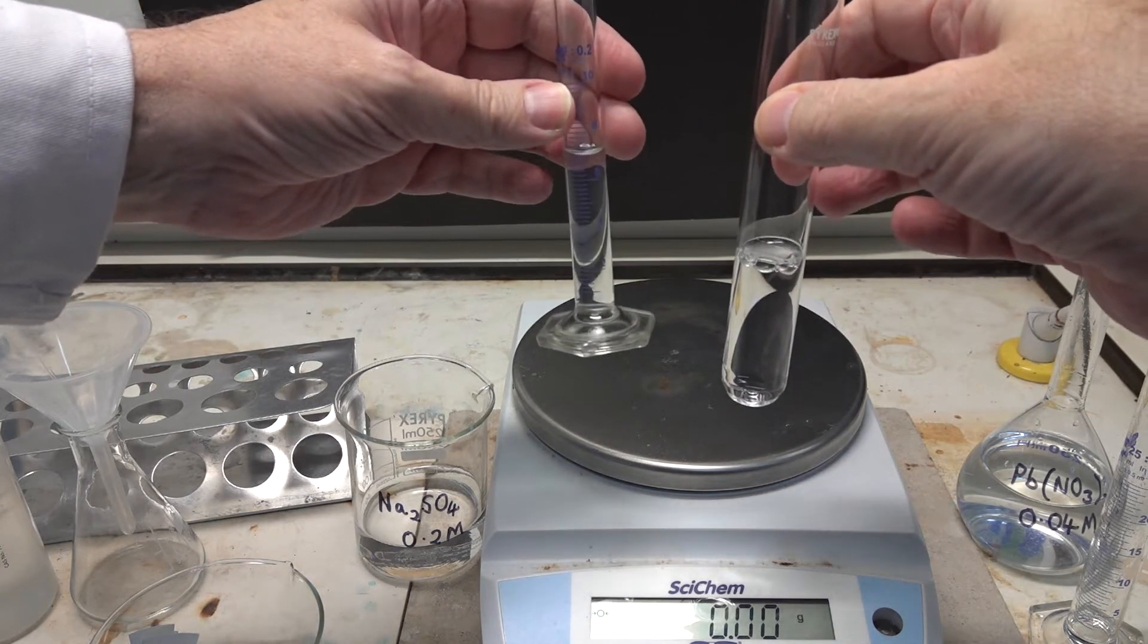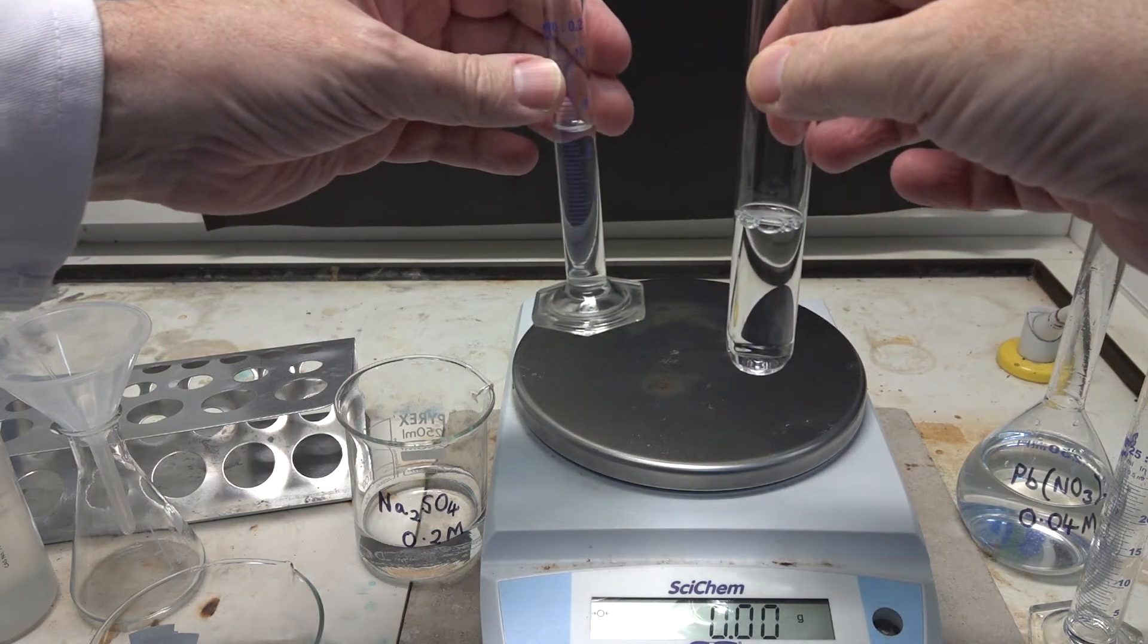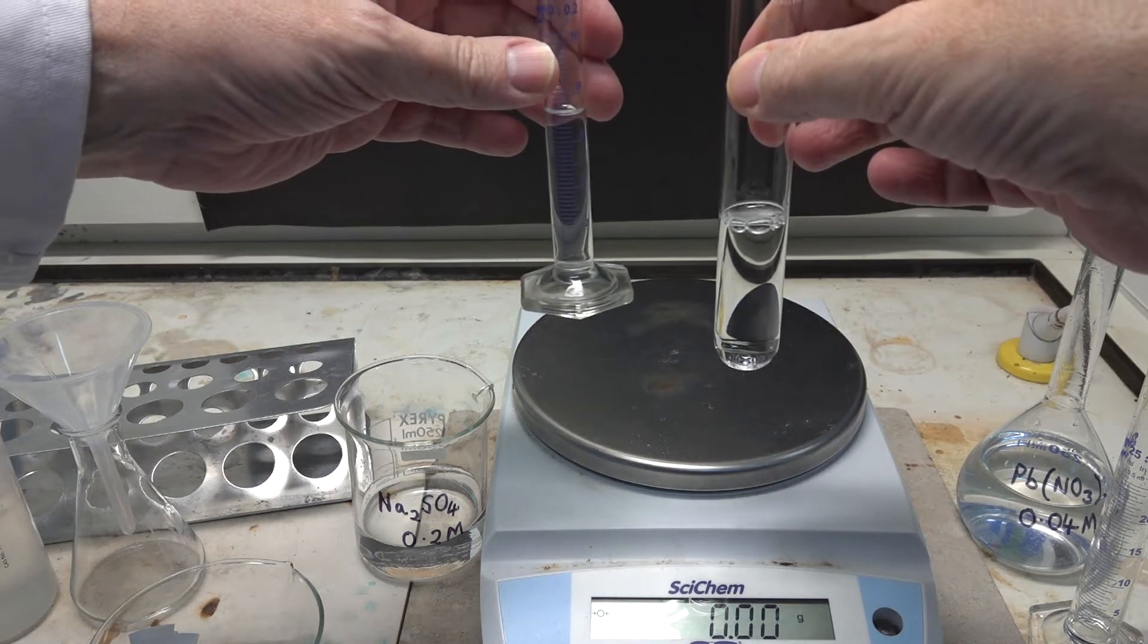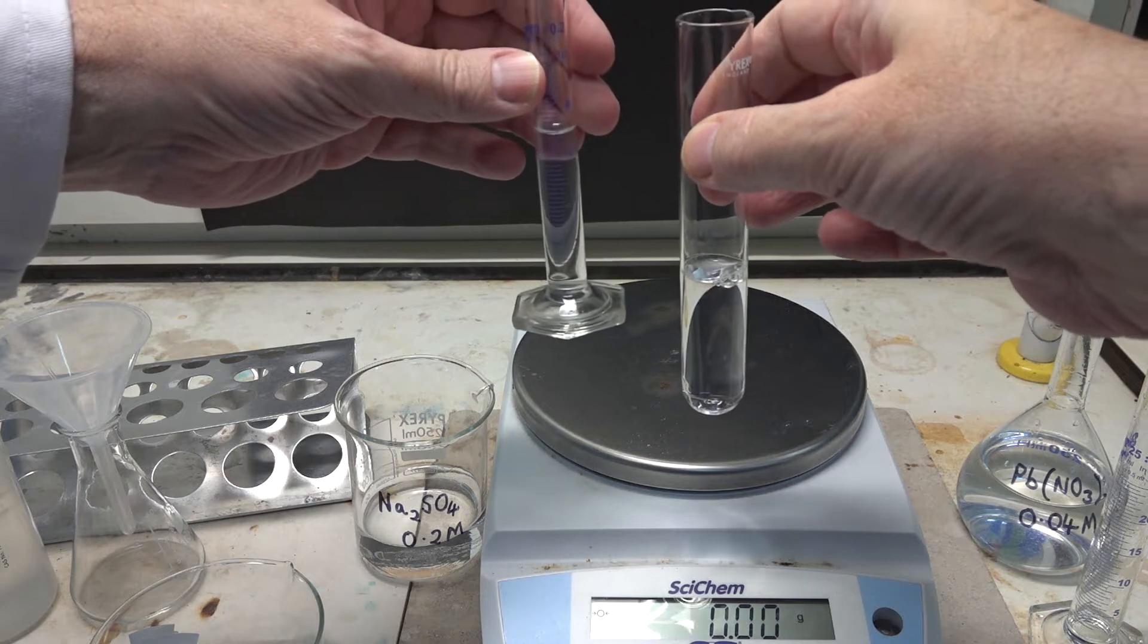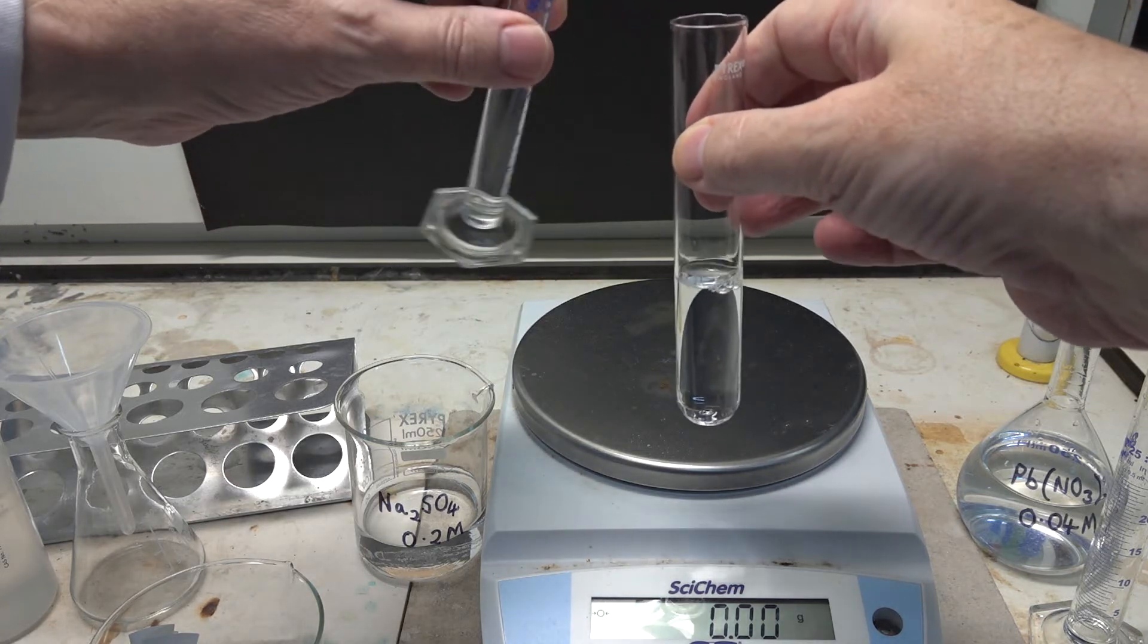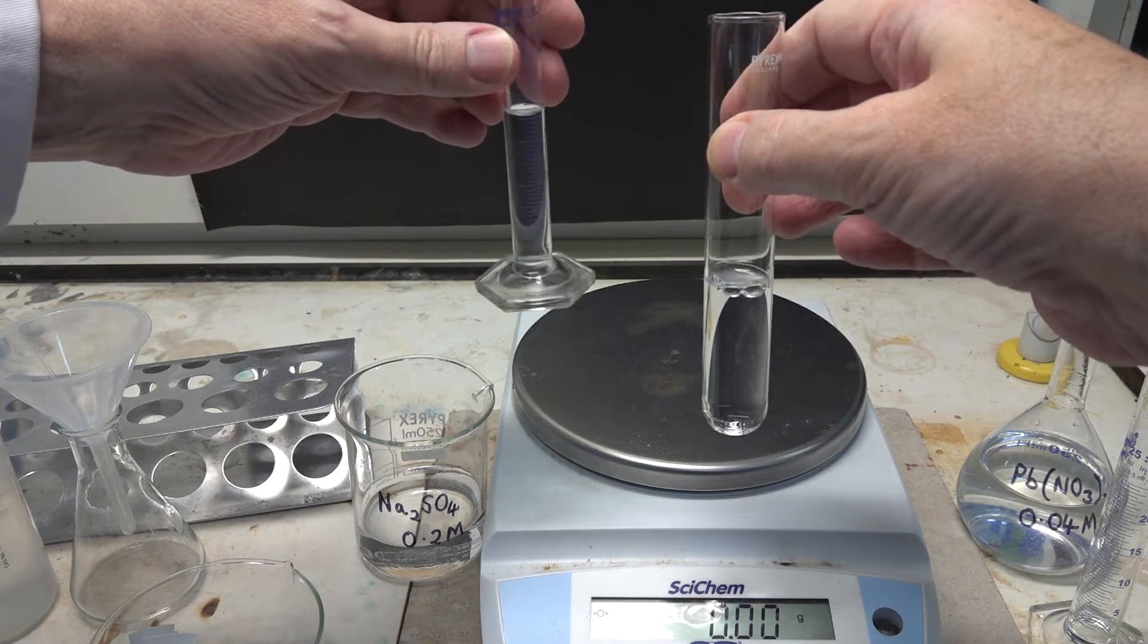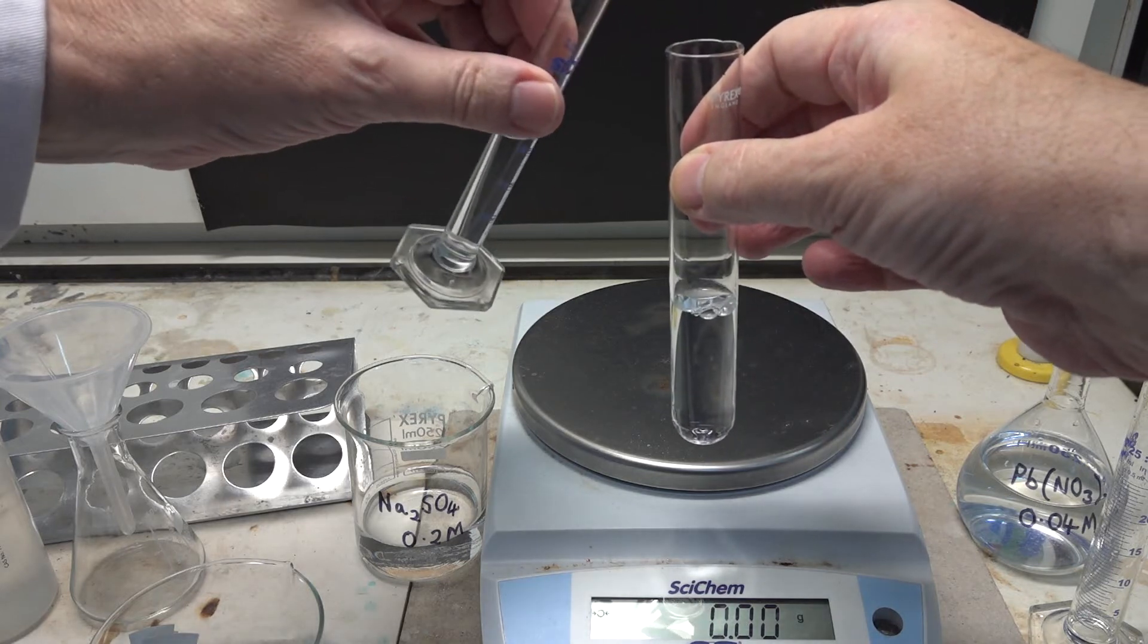Into that we're going to react it with 7 centimeters cubed of 0.2 molar sodium sulfate. You'll be able to work out by calculation which of the reagents should be in excess.